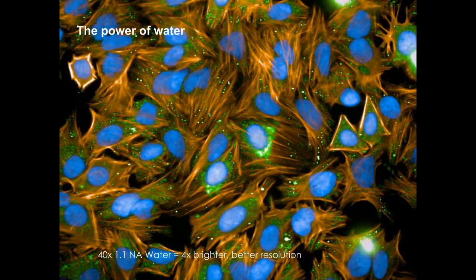As you will see, this image is much brighter, actually 4 times brighter, and it also provides better resolution. This is very beautiful, and it also gives you a glimpse of what is possible with high content screening today in terms of resolution and cellular detail, but it might not be quantitative enough for your taste.